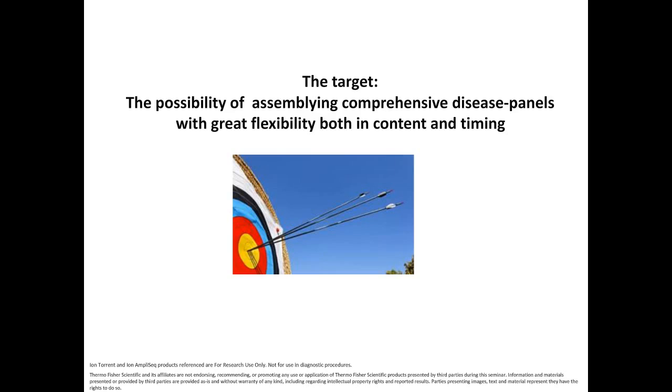But we report both. We report our in silico coverage, which is how well were we able to put our primers in such a way that the amplicon covers the whole exonic region or the CDS regions. And then the expected coverage is, okay, what is it that we observed in the lab? So we report both, and those can be accessible from the IGV viewer as I showcased in the demo.